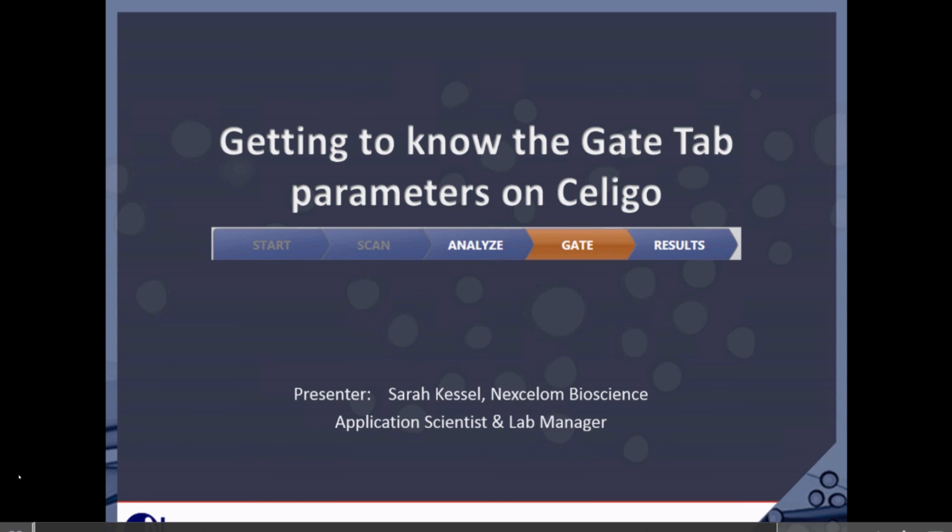A little heads up. The first portion of the presentation today is going to be a PPT with some technical information, so it's a good time to take notes on that part of it. And the second half will be showing you examples on the Celigo of different applications you can use with the gating tab. So the first part is going to be more verbiage and technical detail stuff, so that's a note-taking portion. The gating tab, it's intimidating, but it's very powerful.